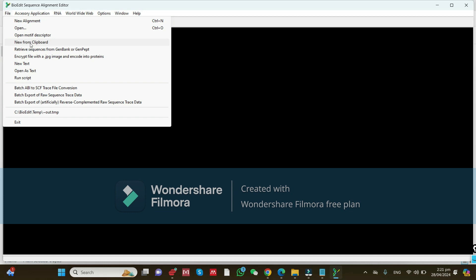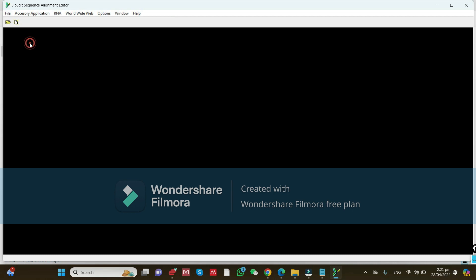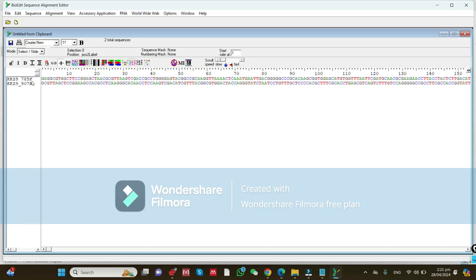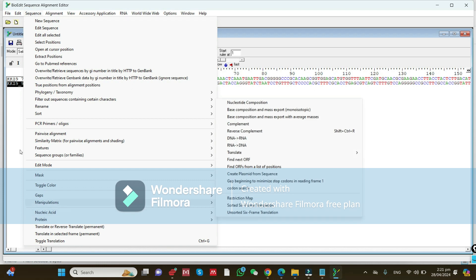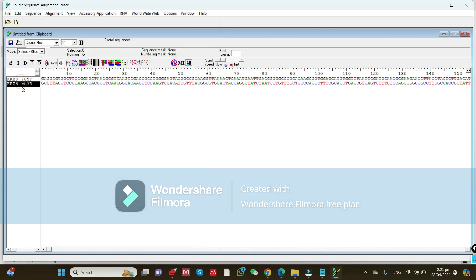Click on 'New from Clipboard' and it will show all the forward and reverse sequences. Then you need to prepare the complementary sequence of the reverse sequence. Go to the sequence menu and click on the reverse sequence first.